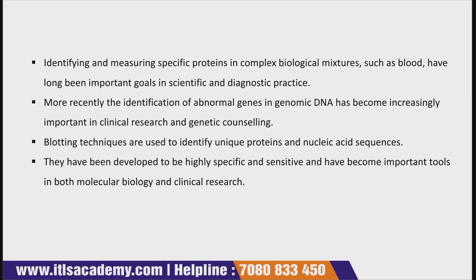Then identifying and measuring a specific protein in a complex biological mixture such as blood has long been an important goal in scientific and diagnostic practices.